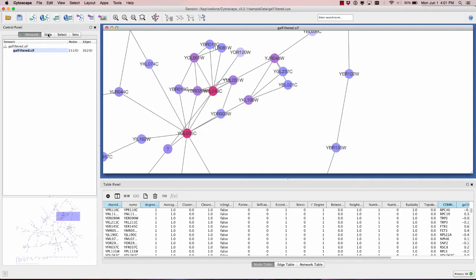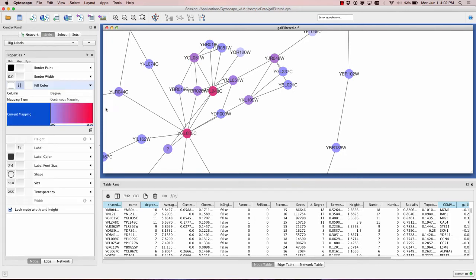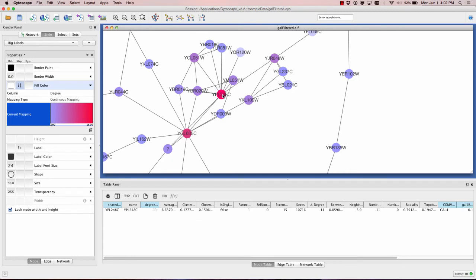The idea of this visual style is that there's data associated with nodes - it could be gene expression data or whatever other data you've loaded in. These visual styles allow you to map data to some visual property. I can color the nodes based on a gradient according to how connected they are. I can also change the border color according to some other gene expression data.